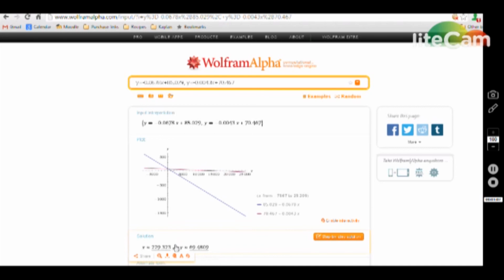That is in fact very close to the value of 70 that we estimated from the graph, so we can be confident that we've typed our equations in correctly and that we've used the correct value. You'll note that it could be easy to accidentally use the X value here, and then you would get a very unrealistic melting point for the stearic acid.